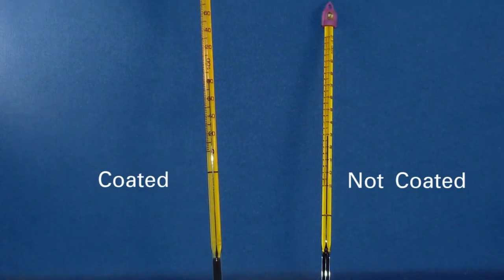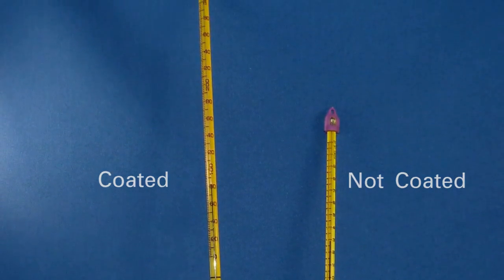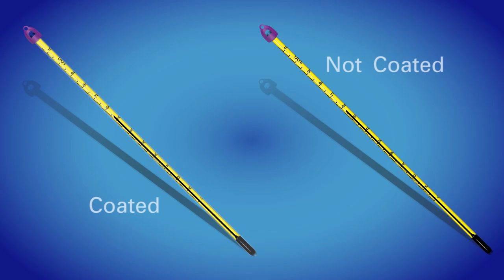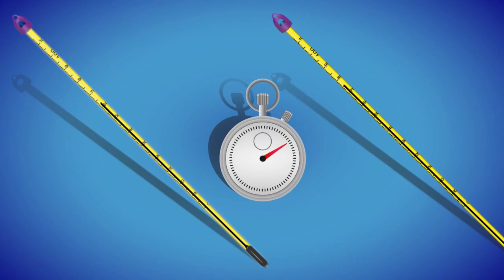PFA safety coated thermometers look nearly identical to non-coated thermometers. They are also as accurate; however, the PFA safety coating may slow the response time of the liquid column to reach equilibrium temperature.